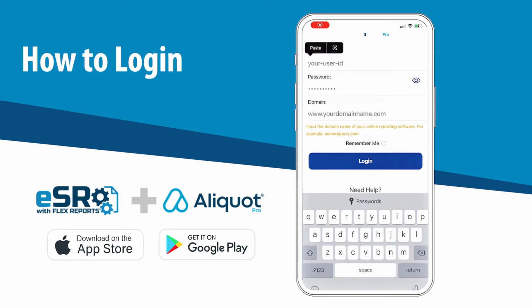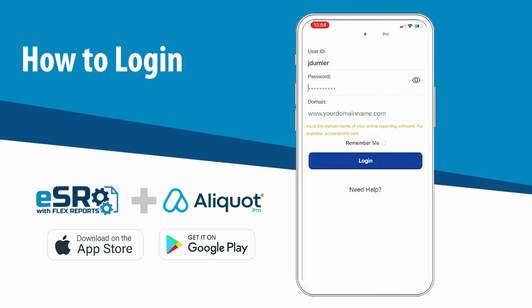Enter your user ID or email address as it appears in your site. Letters are case sensitive and need to match exactly. Enter the same password used to log into the site. Letters are case sensitive and need to match exactly as it is saved in the site.